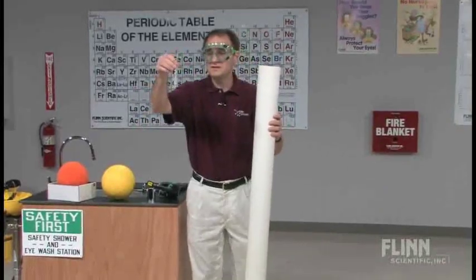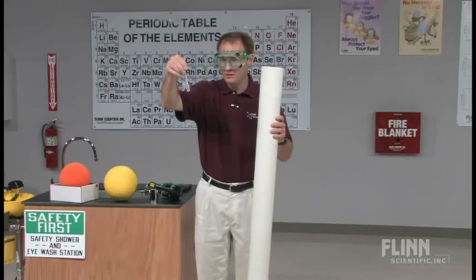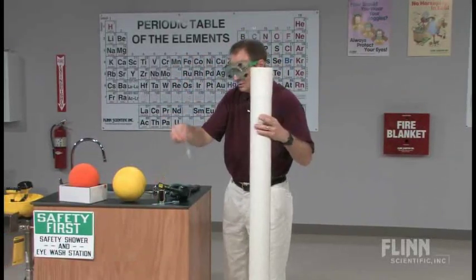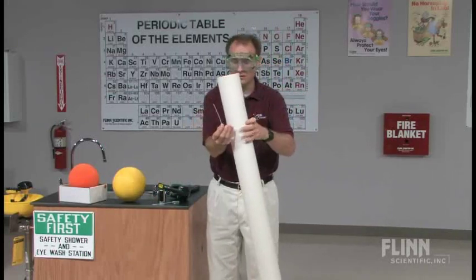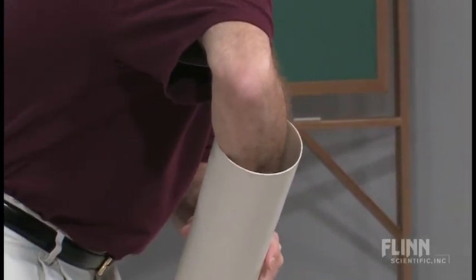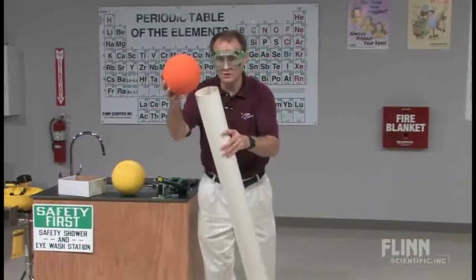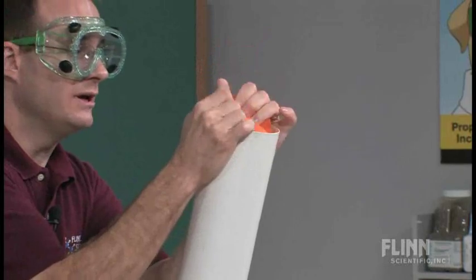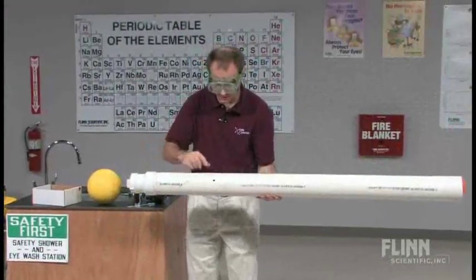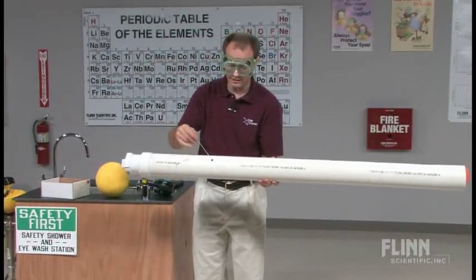The procedure could not be easier. I have two thin-stemmed pipettes, each containing 95% ethyl alcohol — four milliliters total, two milliliters in each one. I'll add one squirt of the ethanol going up to my elbow and add that squirt inside the barrel. Since we're inside here at the Flinn studio, I'm going to use the indoor version and push the ball in like this. With the alcohol already inside, I then find the ignition hole and add my other squirt of alcohol directly in there.